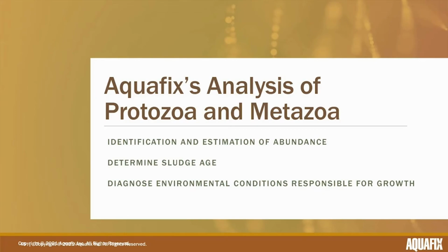So in our analysis, we quantify and identify metazoa and protozoa as they help us determine the sludge age and diagnose possible environmental conditions responsible for their growth.